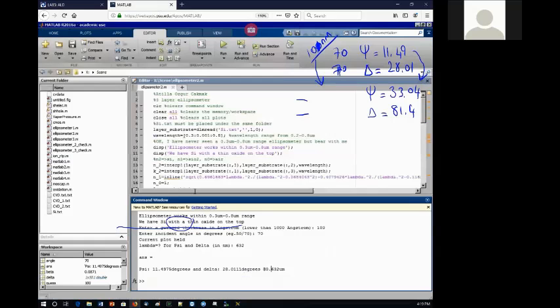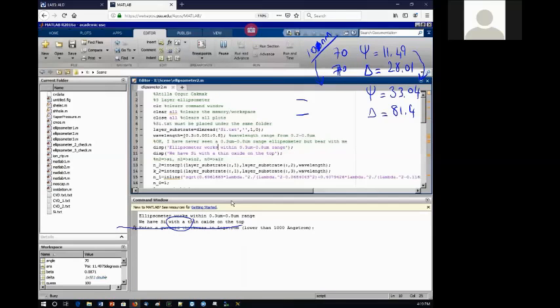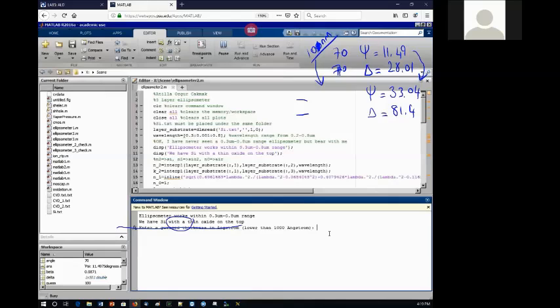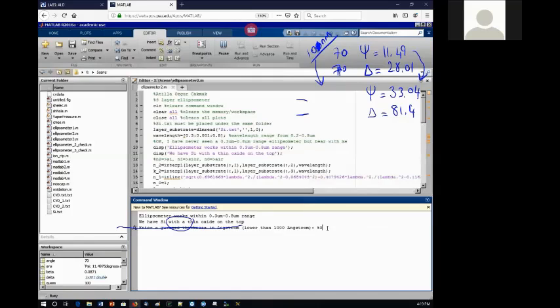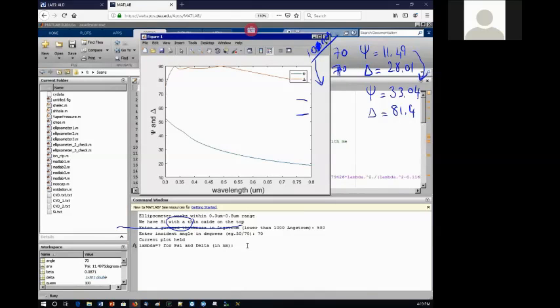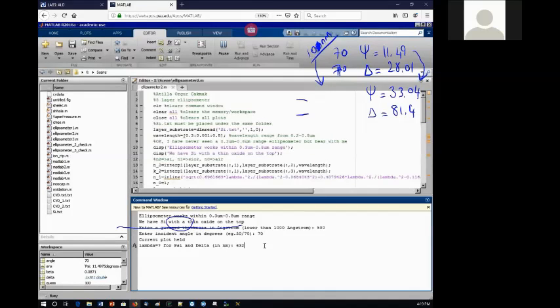Okay, let's go back to ellipsometer 2 one more time, and let's run it again. This time, instead of 100, let's say 500. I think I said 100, right? You guessed it was the first time. Yeah, you can check it from the memory too. It's 100. It has a wonderful memory, unlike me. So I will say 500 and then hit enter. I'm going to stay the same, 70 degrees, and I will look at the same 632 nanometer laser wavelength.